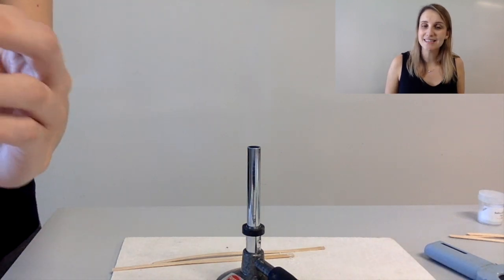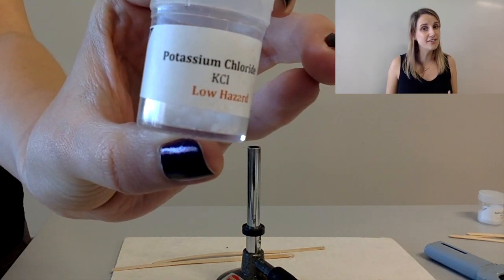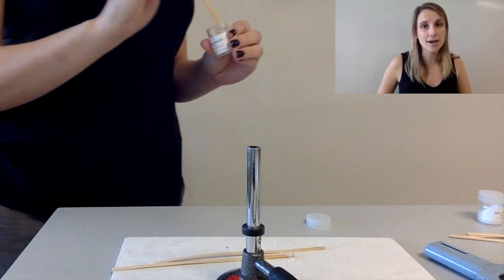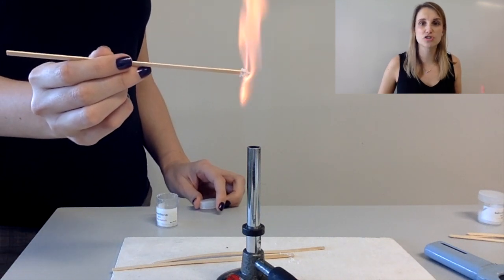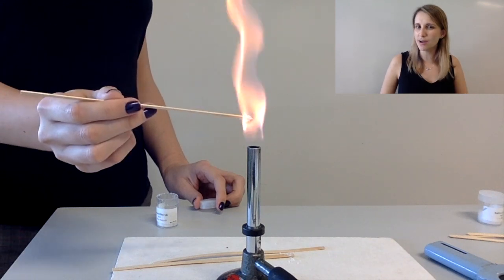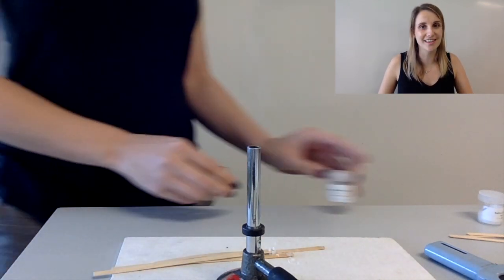The third one is potassium. Now potassium probably gives the most difficult color to see of all of them, and the potassium ions will show this lilac color. Lilac is just the description of a very pale purple. So check it out — can you make out the pale purple? Otherwise you might want to do this yourself in the lab.